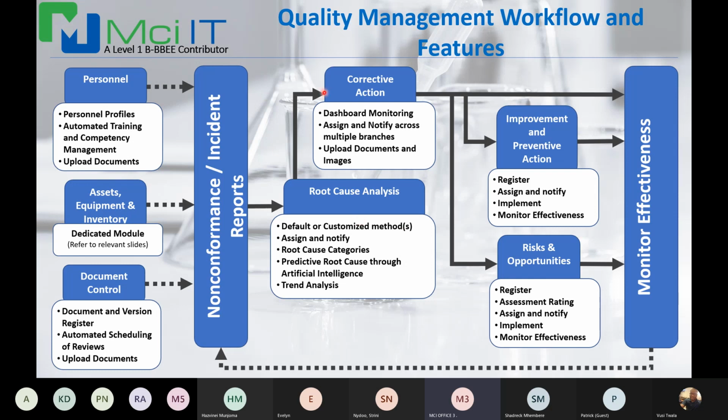Following root cause analysis would be corrective actions. Again, different actions assigned to different people. Comes with, again, the same kind of dashboards that we were looking at in the LIMS module. We'll look at the quality management module in just a second. And again, across the board, the user can upload documents and images as well.